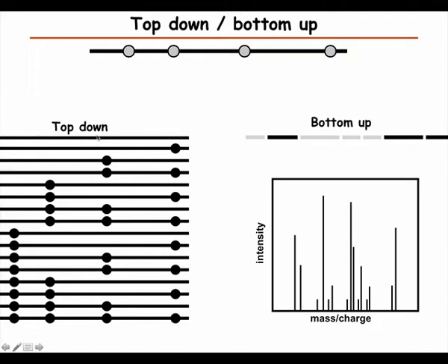The one state where, let's say, just this one is modified here, or this one. Or we can't, in the bottom-up case, distinguish that from sometimes both of them being modified, and sometimes none of them. And also often we don't see the whole protein.